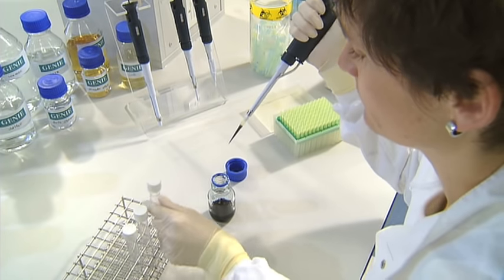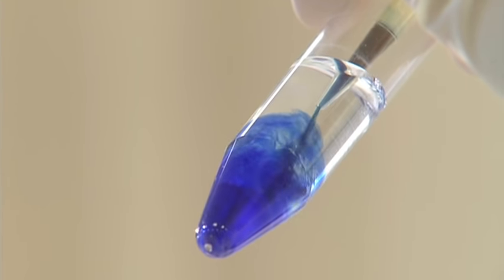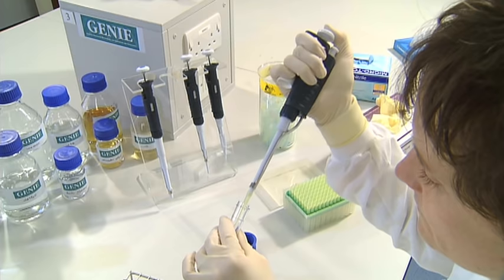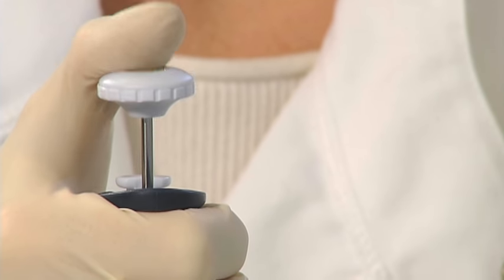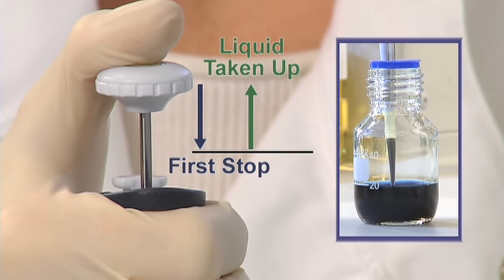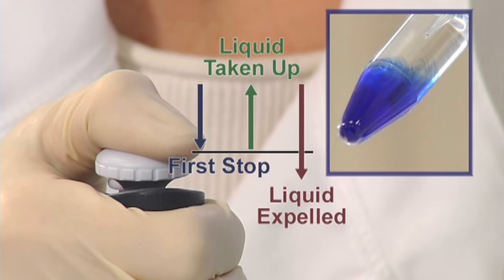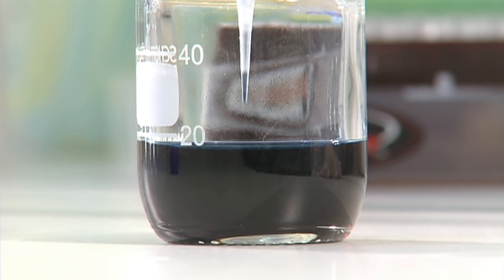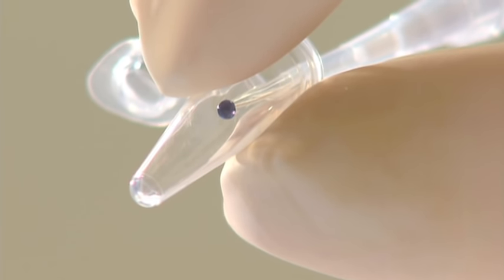Withdraw the pipette tip from the liquid and place it inside the recipient container. Slowly push down on the push button to release the liquid into the tube. This time, push beyond the first stop to ensure any residual liquid is expelled from the tip. Fully withdraw the pipette tip from the liquid before releasing the push button. For very small volumes, the aspirated liquid can hang as a drop from the tip, so touch the tip to the inside wall of the recipient container whilst expelling the liquid.